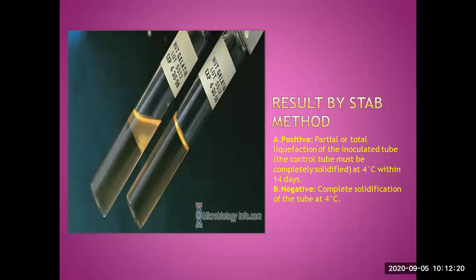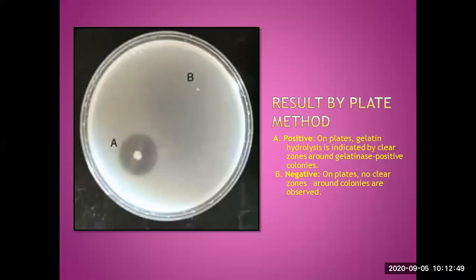We remove the procedure from the incubator and place it in the refrigerator for checking. The control tube remains solid. The tube showing liquefaction gives a positive result. The tube with no liquefaction is completely solid. In the plate method, a positive result shows a clearing zone surrounding the colony, while a negative result shows no such clearing.